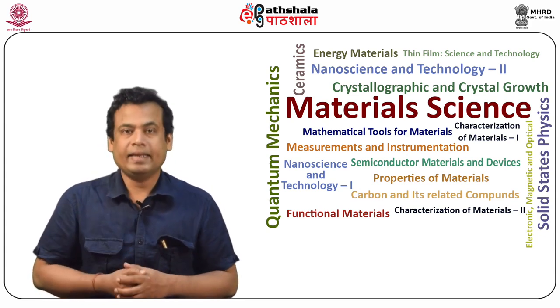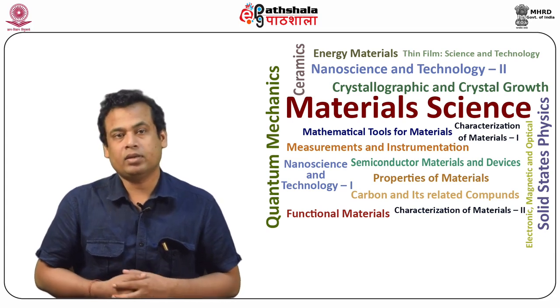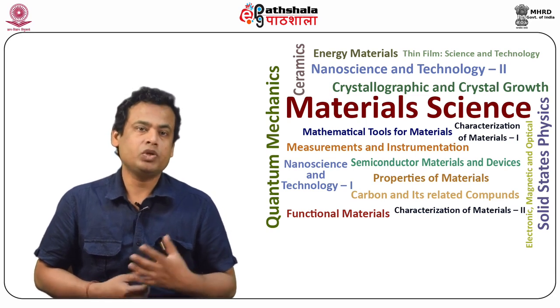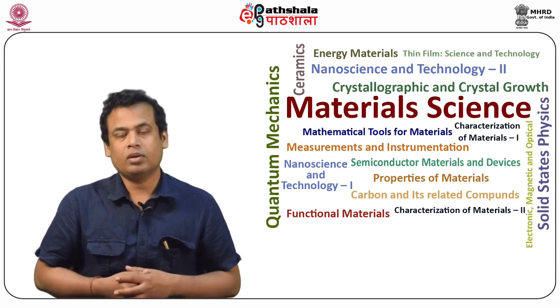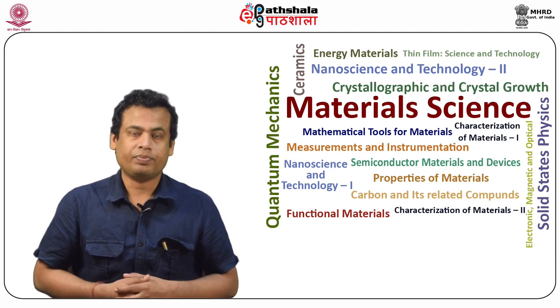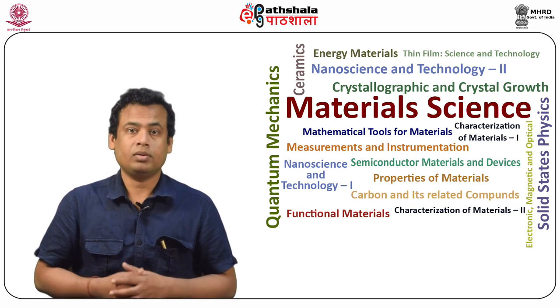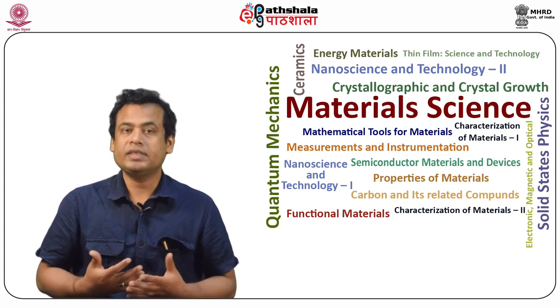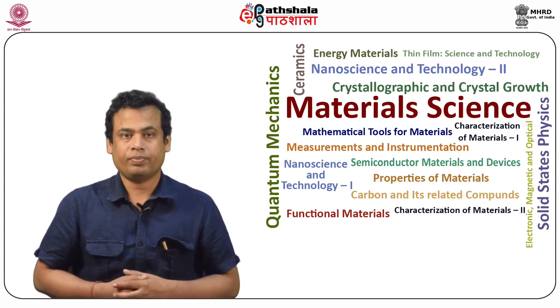The secondary electron coefficient is defined as delta equal to NSE divided by NB, that means the ratio of the number of secondary electrons from the specimen divided by the number of beam electrons incident on the specimen. The escape depth of the secondary electron is small, a few nanometers, so all of the secondary electrons created by the beam electrons at greater depths are lost.